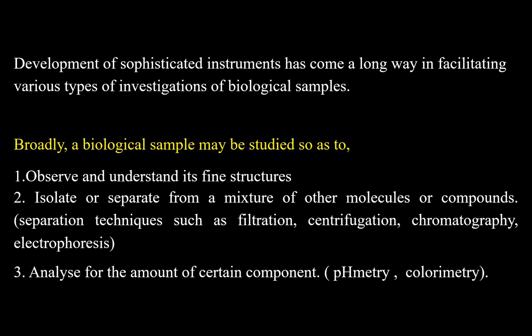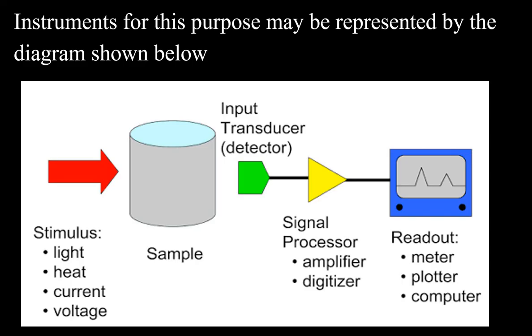Separation techniques such as filtration, centrifugation, chromatography, and electrophoresis vary according to the need. Third, to analyze the amount of a certain component with the help of various instruments such as the colorimeter.